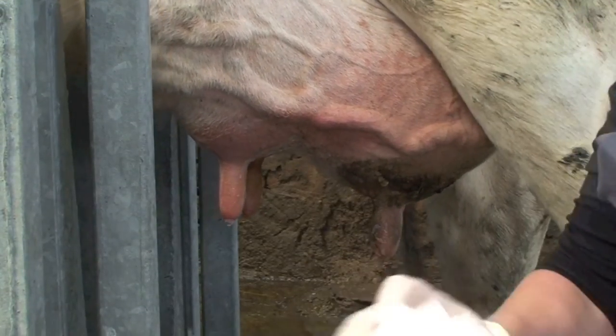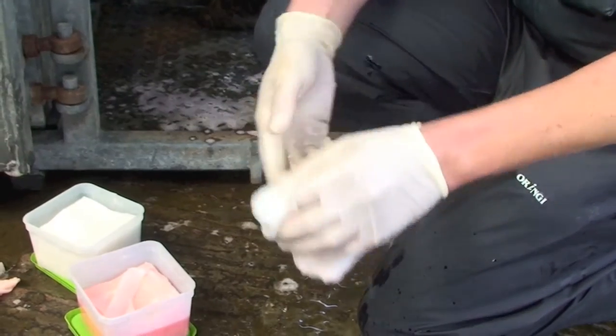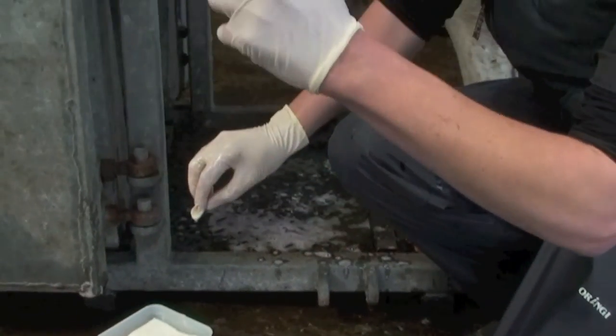We've cleaned off the teat. The next thing to do is to clean off the gloves that we're wearing, making sure that we've got no remnants of anything left on us, and that's done with some surgical spirit.